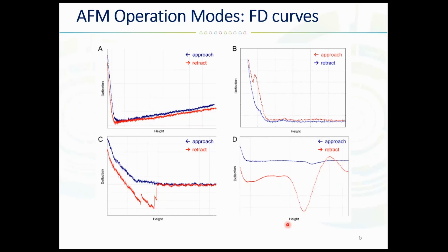For example, this particular curve on the slide was taken from an experiment measured in a liquid medium, and the cell that was measured could be floating, or another piece of debris was passing through the laser beam, and the measurement was disrupted here.